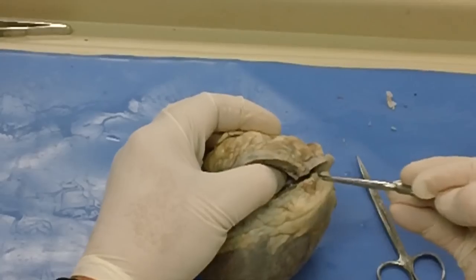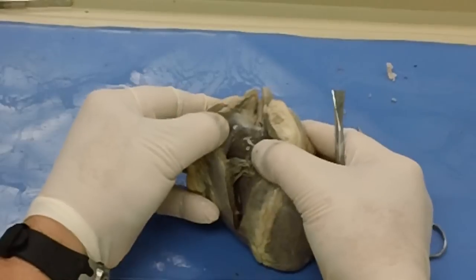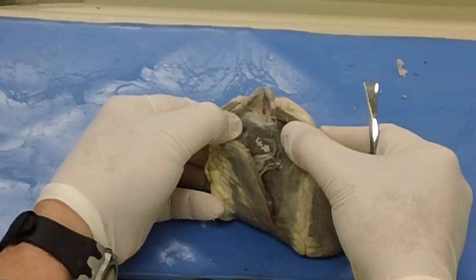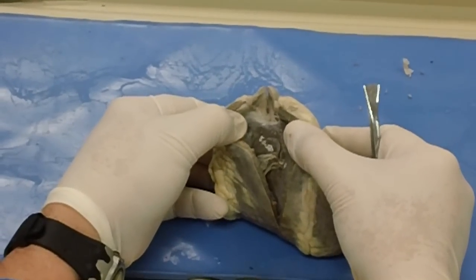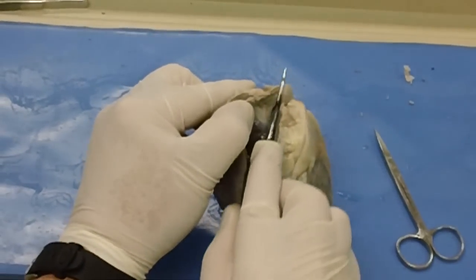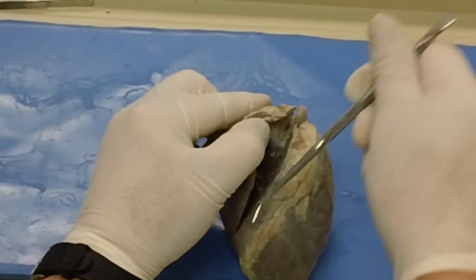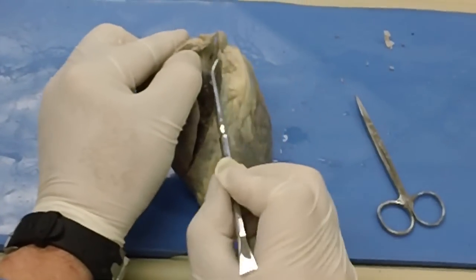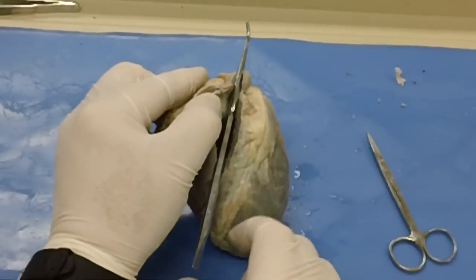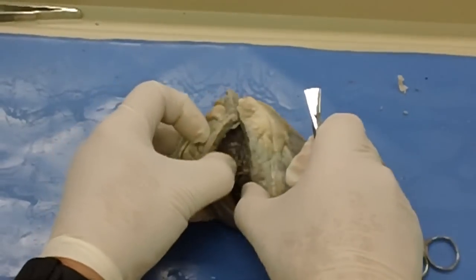That means I'm now inside what chamber of the heart? The right atrium? No? Right ventricle. Because I'm in the pulmonary artery. I came down the pulmonary artery, so I'm going backwards, against the direction the blood is flowing. The reason I did that is because it's so much easier. So the right ventricle is here.